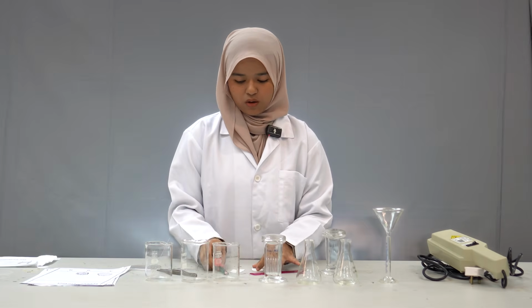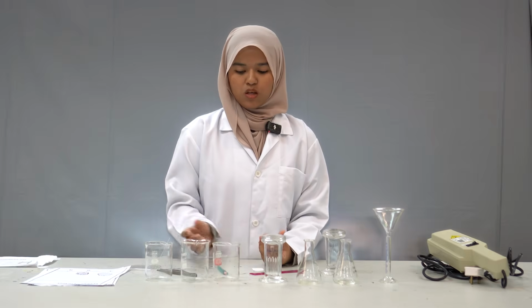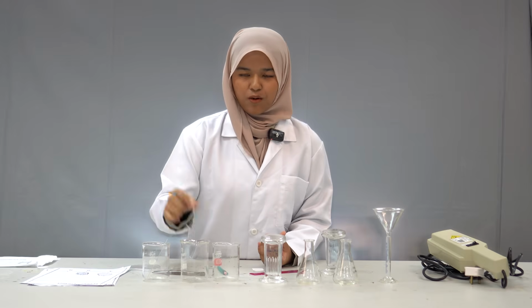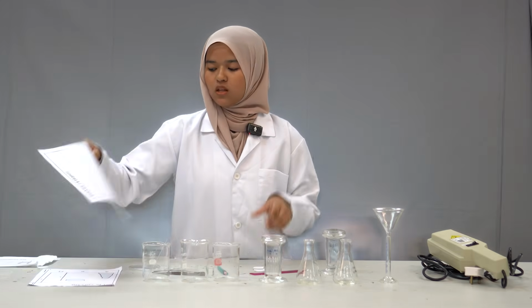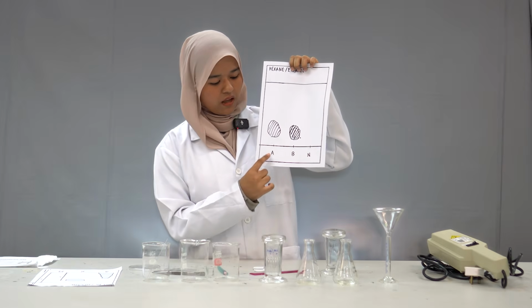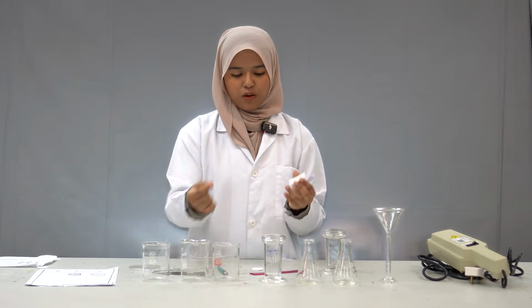After that, we will use a capillary tube to take our compound from the beaker to our TLC plates. Don't forget to label your compounds: acid, base, and neutral. Then we will spot each compound at the baseline.